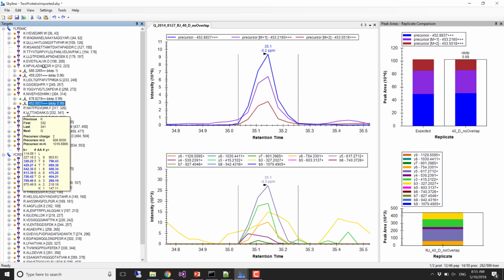But I was looking at some of them, and I found one that was really two fragment ions, and then 4 different neutral losses from those fragment ions. And I'm like, well, okay, that's not really a whole lot of evidence of the peptide, 2 fragment ions and then 4 neutral losses of those fragment ions. So, yeah, exactly what transitions to use is still being developed.